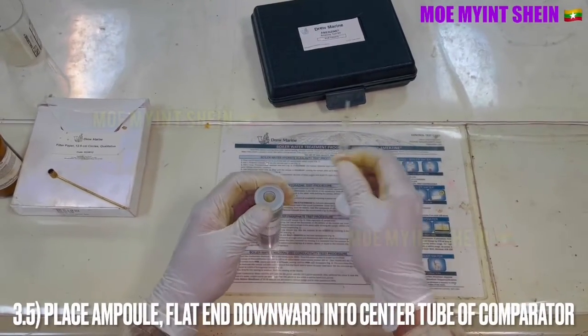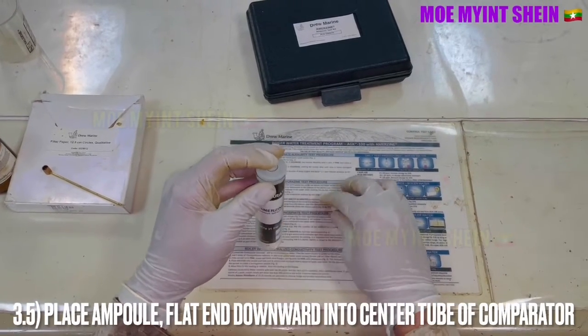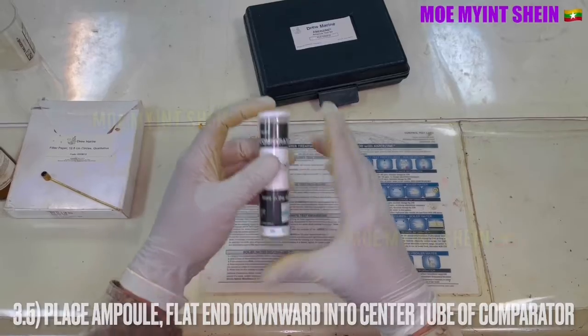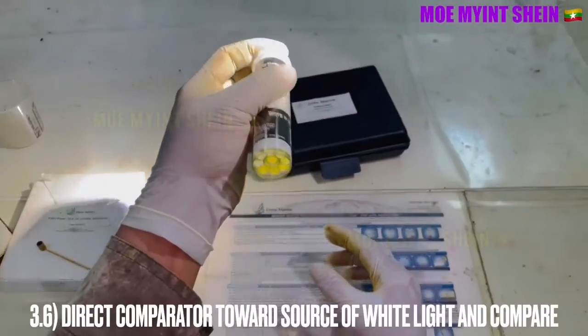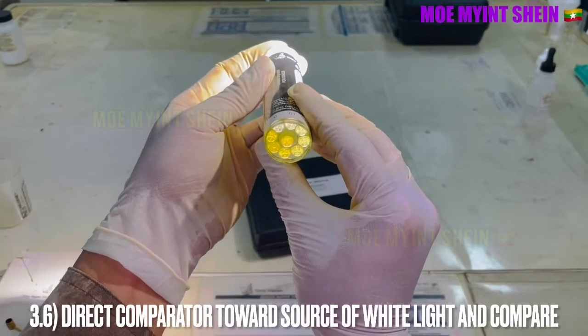Place the flat end of the ampoule downward into the center tube of the comparator. Direct the comparator toward the source of white light and compare the color.